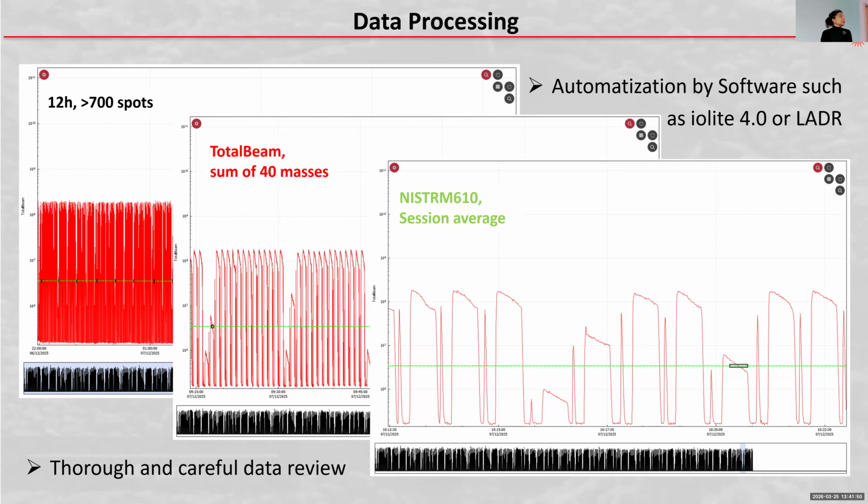However, having said that, using software packages makes your life way easier. However, you have to do your due diligence. This is kind of where I lose a lot of people on laser ICP-MS, because philosophically I get it. You're so excited to finally get your data and make a good story out of it. And while for other methods, you do all the nasty and annoying work beforehand and then collect the data, sometimes even reduced and calibrated for you by the software and by the ICP-MS, and they spit out the results for you. With laser ablation, the annoying part is afterwards.